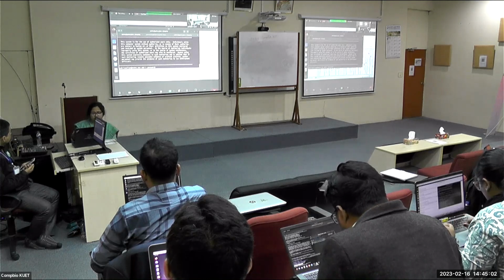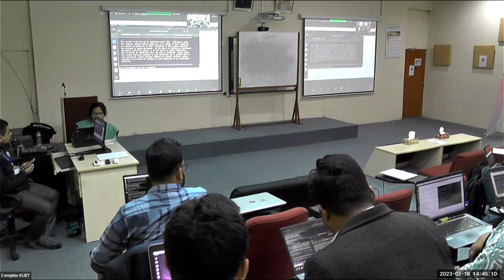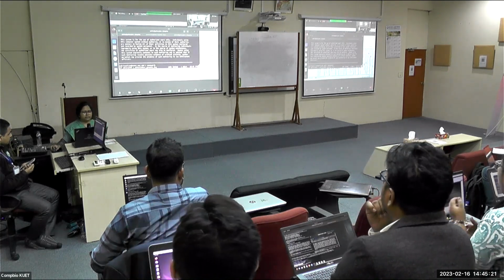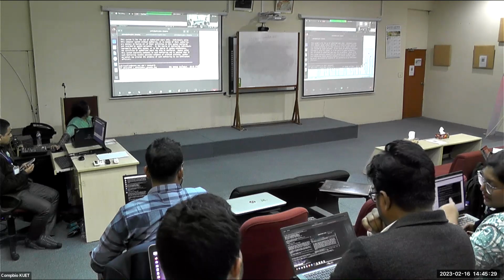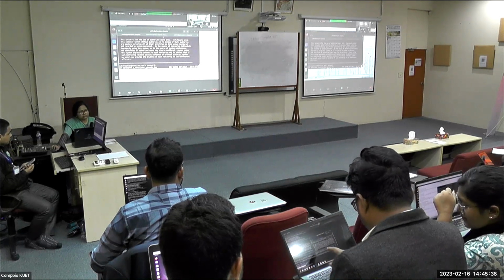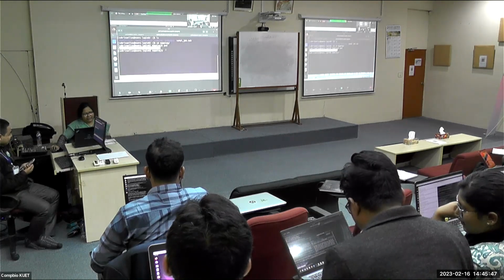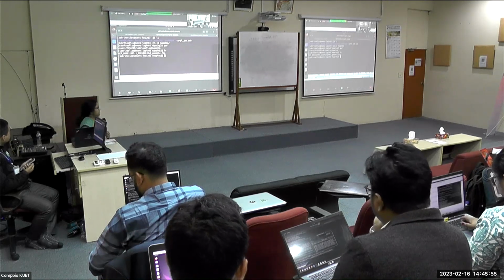And now what you are going to do is, using HPC will do the job. I mean, you'll submit the job. So it's being transferred, and it's almost transferred there. It's the whole genome of E. coli, so it can take time, no wonder. 99% হয়ে আটকে আছে. Okay, so if we now check here by writing ls, we can see that the file is there. The fna file is there.